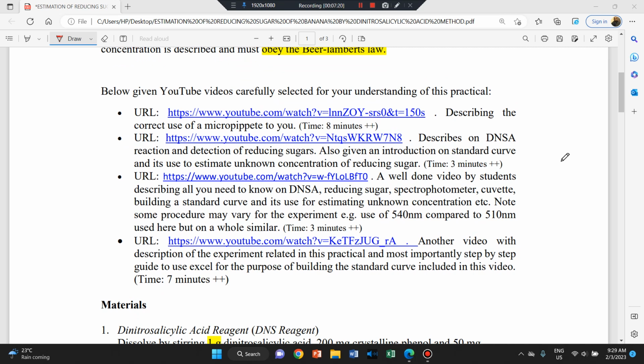Therefore, you need to have different micropipettes. But for this purpose, it's sufficient to have that micropipette that can measure below 1000 microliter or 1 ml. And normally the tips for that are blue tips. Okay. And hopefully you watch the micropipette video and therefore you are familiar. Before you come to the laboratory, we will also demonstrate hands-on how to use it.